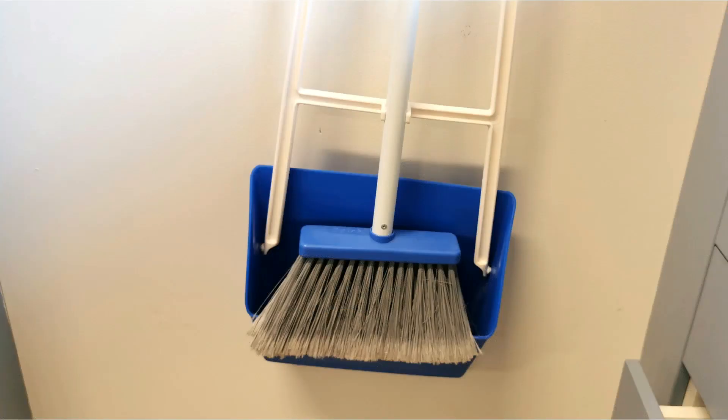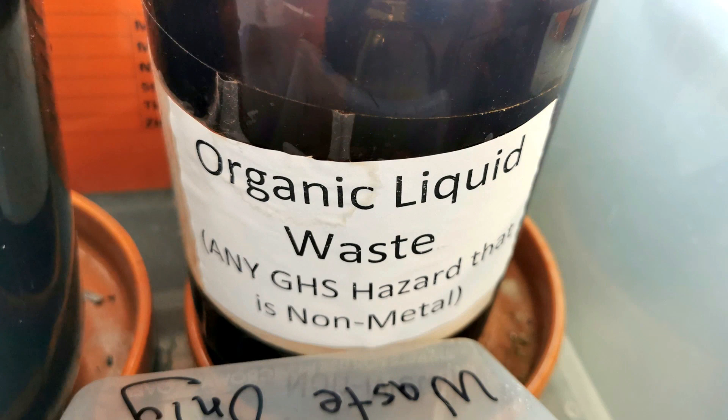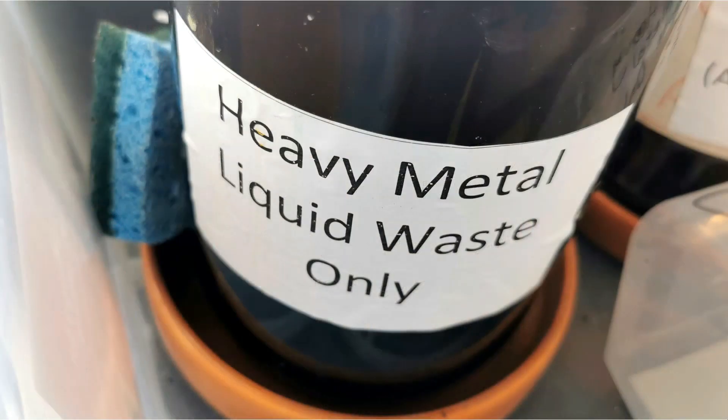If you break some stuff, sweep it up — there should be a dustbin and broom somewhere around. If there's any broken glass, that doesn't go into the normal rubbish bin — it goes into a proper glass bin, and your teacher will show you where that is. When you've finished and got some stuff left over, you don't necessarily just wash it down the sink. Some substances are okay to go down the sink, but often they're not — so you'll find bottles for organic waste, heavy metal waste, etc., because some things really should not go down the sink.